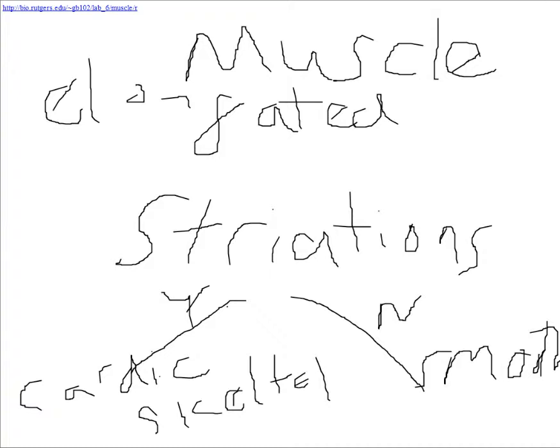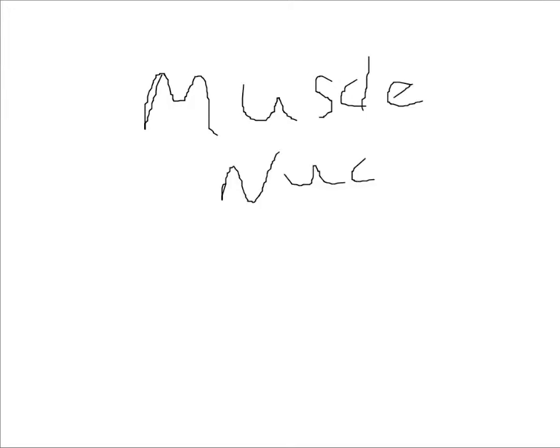We'll create a new page here. A striation is a perpendicular line. If the muscle cell in a particular slide we look at is running parallel or horizontally, and this isn't always the case, we'll see these perpendicular filament lines somewhat close together.